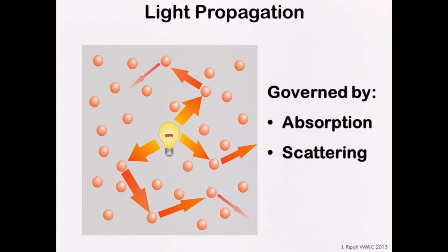There's problems everywhere. Okay, the most important things when you consider light propagation are absorption and scattering.